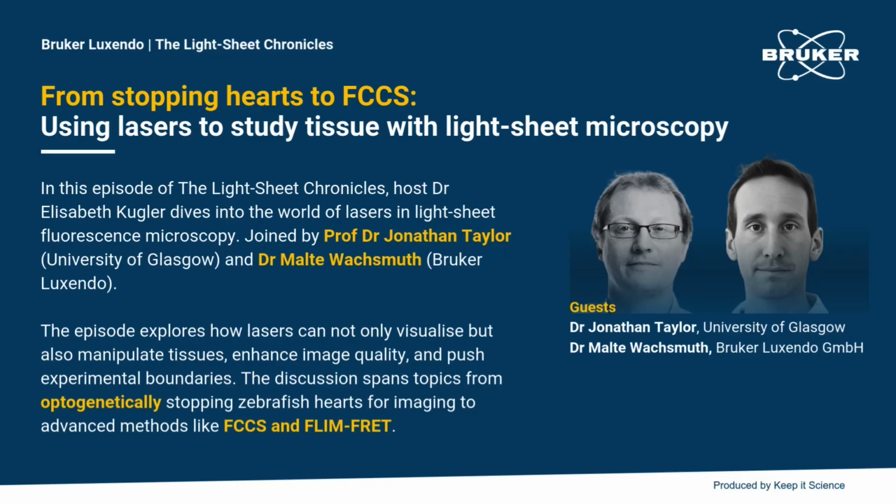And because we're in the heart here, we're back to this problem of imaging moving tissue. We want to be able to image this in a wide field snapshot because we want to see the whole field of view of the heart. And then we've got the additional challenge that FLIM-FRET is typically a very photon-starved modality. You're really struggling to get as many photons as you possibly can from these fluorophores to make these measurements, which again connects with your next topic of image analysis and the challenges of working with very low photon count images.